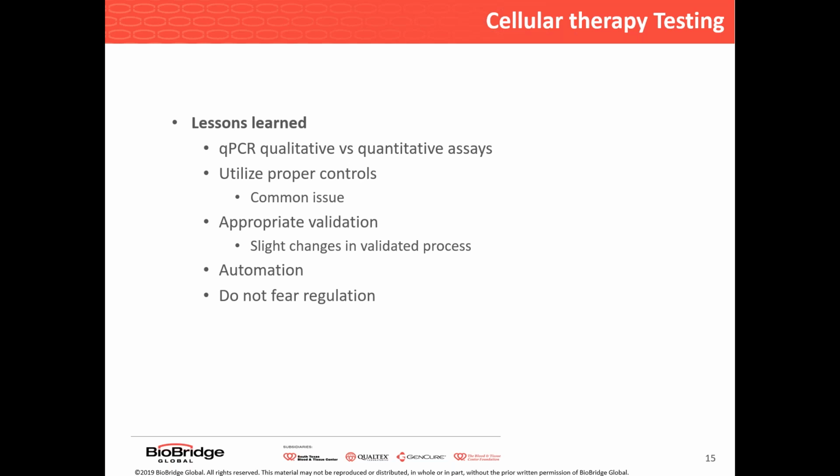And then very briefly, the other thing is proper controls. This is a common thing we see when we're tech transferring assays from development companies over to us to actually use for production: you really have to make sure that you have good positive and negative controls, possibly even an external control, to really control for all that variability like Stephen mentioned earlier.